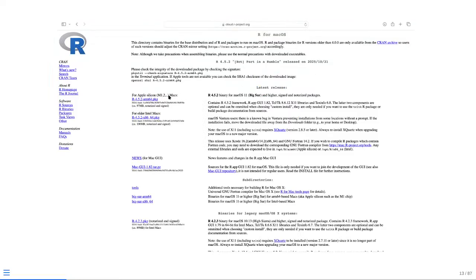So when you're selecting these options, it's these two options right here at the center of the screen. If you have an M1 plus series Mac that's using the ARM silicon, you just select that installer. If you're using the Intel-based chips, you'd select the option below.